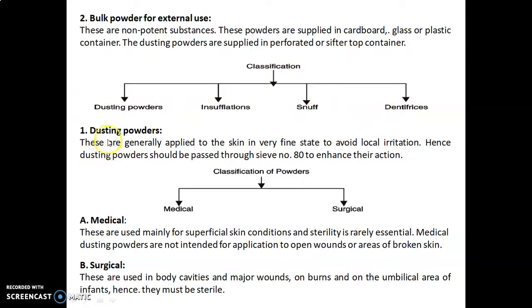We will discuss dusting powder. These are generally applied to the skin in very fine state to avoid local irritation. Hence, the dusting powders should be passed through sieve number 80 to enhance their action. Classification of dusting powder is medical and surgical. There are two classes. We will discuss the medical.